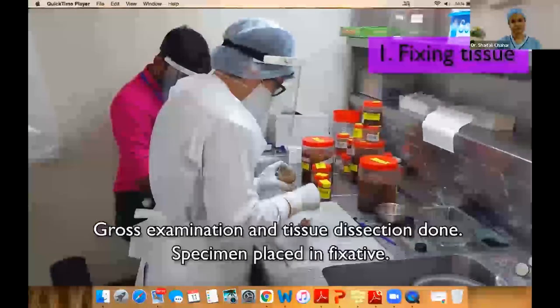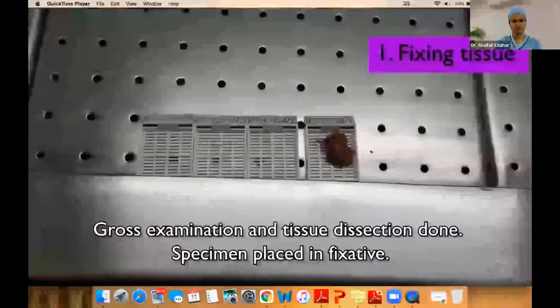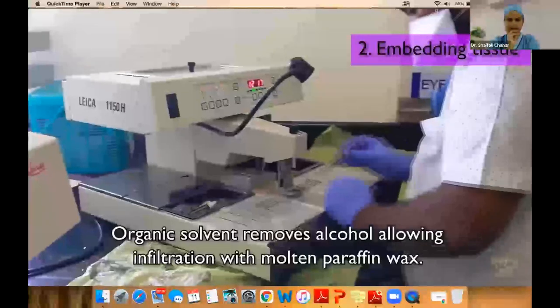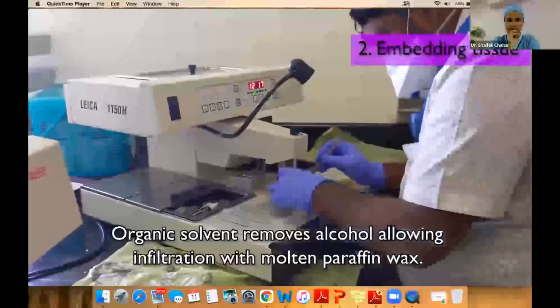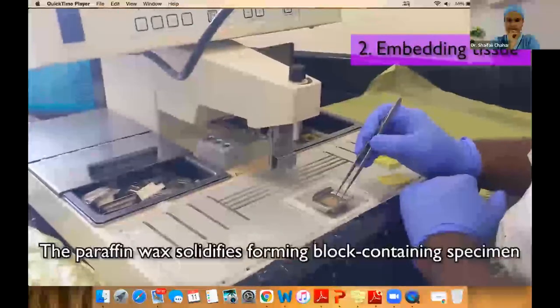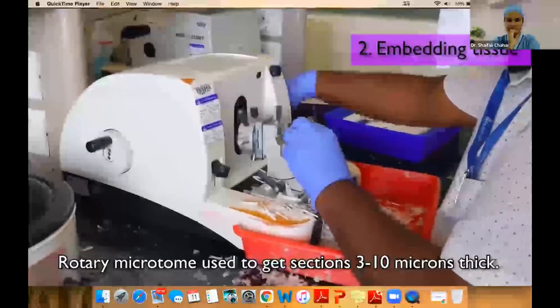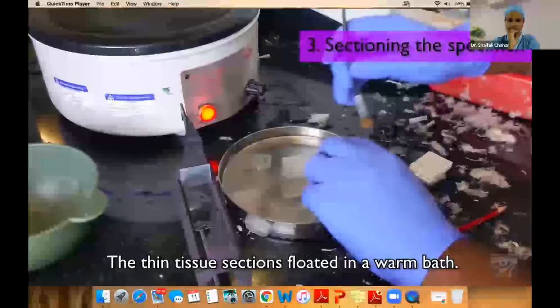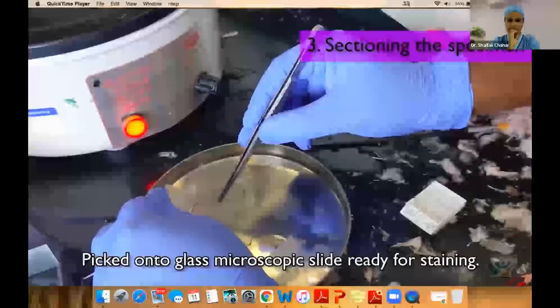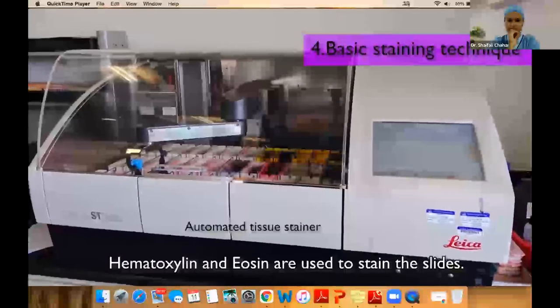Tissues are fixed to preserve and prevent decay and maintain a lifelike structure. Gross examination of the tissue is done as the first step, following which the tissue is fixed. The length of processing depends on the size and density of the tissue being processed, which can take from several hours to overnight. Buffered stain solutions are used to highlight different structures.